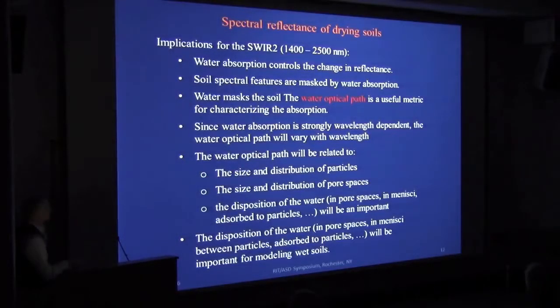Water absorption is strongly wavelength dependent, so we're going to have different types of effects in different ranges. Notice we really couldn't see the SWIR 1 absorption bands, if you will, the shorter wavelength absorption bands, in anything but the quartz sand, because the water optical path was only long enough in the quartz sand to be able to see those absorption features. In the far longer wavelengths, we could see the absorption bands in all of the soils.